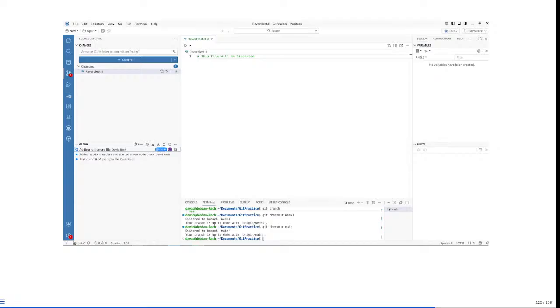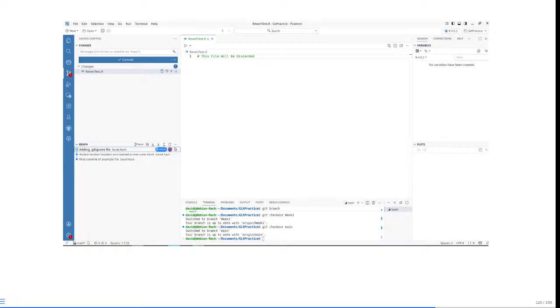So if we're looking at it in this context, when we're viewing things from this window, I think for this one, I created an additional file that I'm going to be adding to its own commit. And then I'm going to commit this, make it part of the version control track record, but then fall back to one of our previous commits that we have already done, just for this example walkthrough.